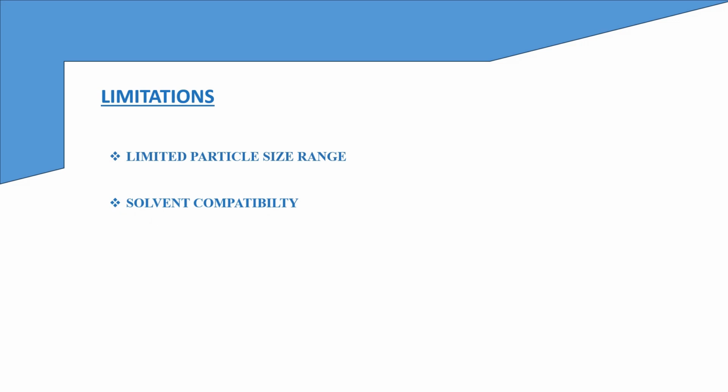It is also limited by solvent compatibility with the instrument's optical and material components. Aggressive or highly viscous solvents may not be suitable. Finally, there is the assumption of spherical shape. Particle size analysis assumes particles are spherical, which may lead to inaccuracies for irregularly shaped particles.